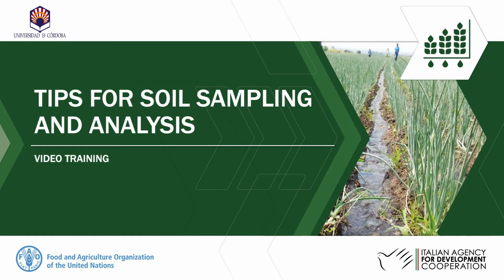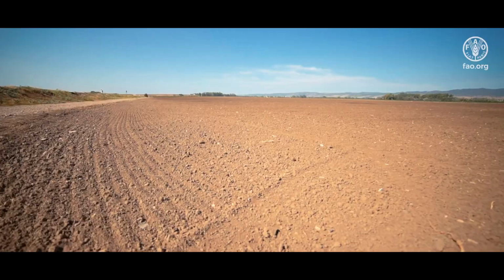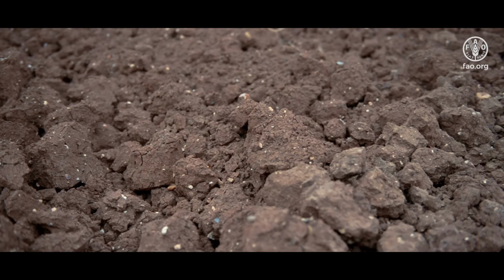Tips for soil sampling and analysis. Soil stores water that is used to maintain plant growth between rainfall or irrigation events.